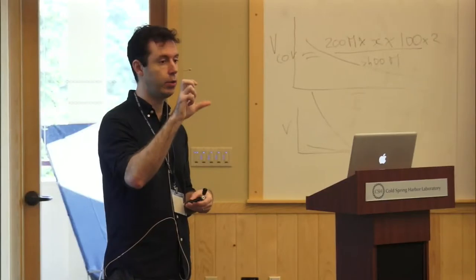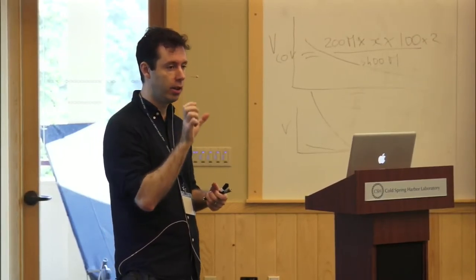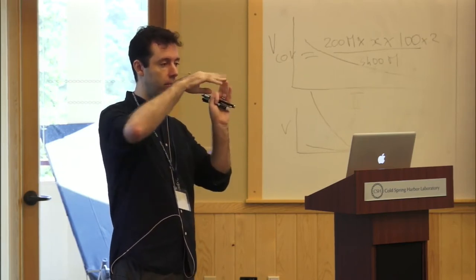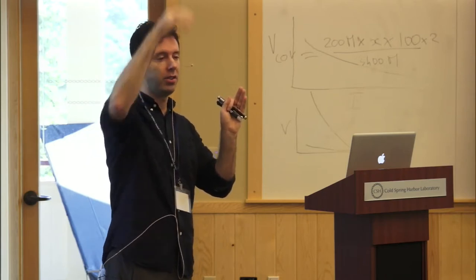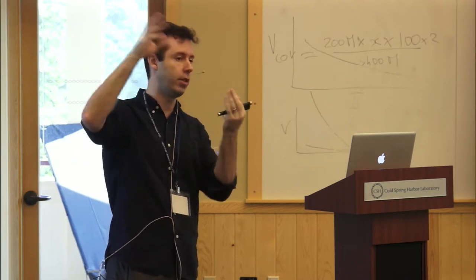Yeah, absolutely. So you definitely have to know. Absolutely. I mean, again, this amplification, these PCR duplicates, are usually reasonably easy to detect because it's usually focal. Typically you have a region that's reasonably uniformly covered in terms of reads, and suddenly you have one read that's duplicated 200 times. So you can tell from the coverage that you have a PCR duplicate problem.